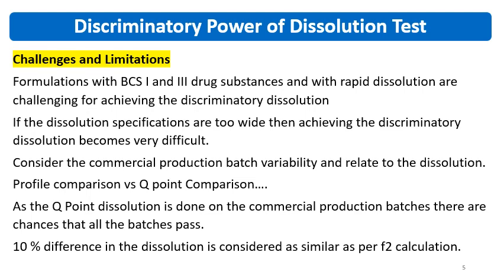You may not prove that your method is discriminatory, but still the regulators are interested to see your efforts and what efforts you have taken for the dissolution development and also to show the discriminatory power.